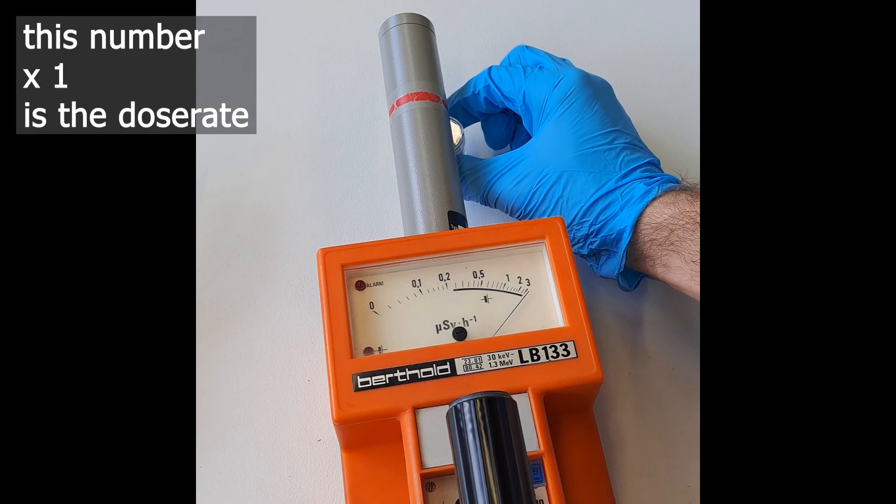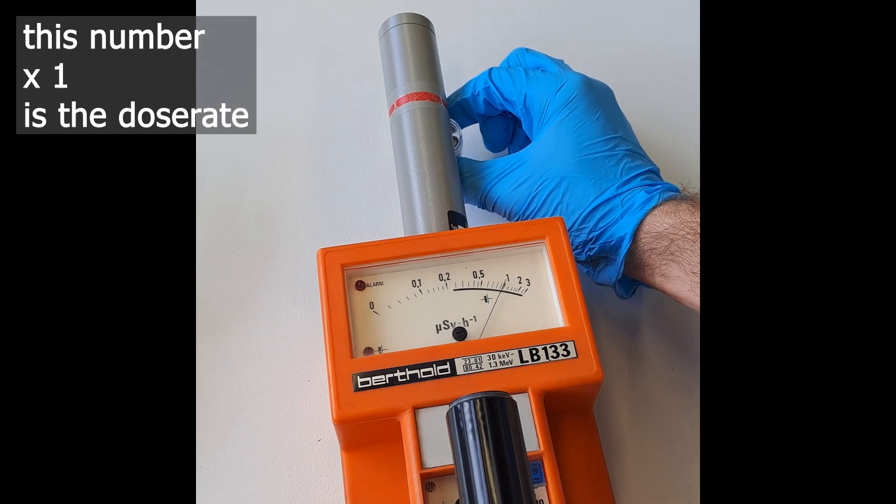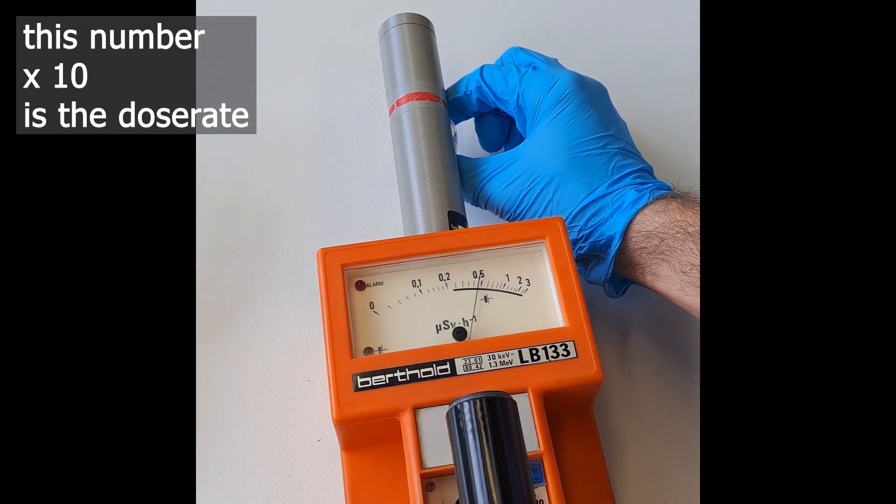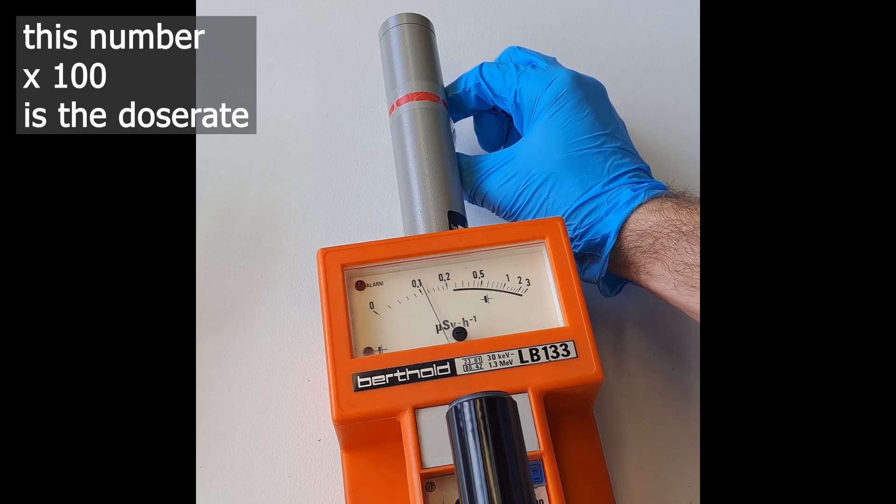A quick check with a dosimeter shows a dose rate of 9 microsieverts per hour. That's roughly 90 times the background radiation, definitely not something I would put under my pillow.